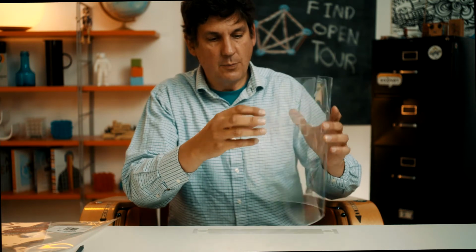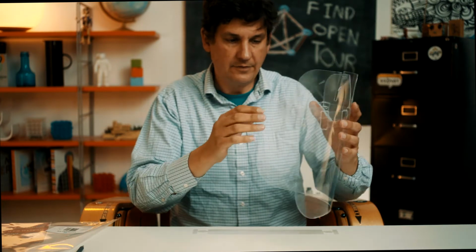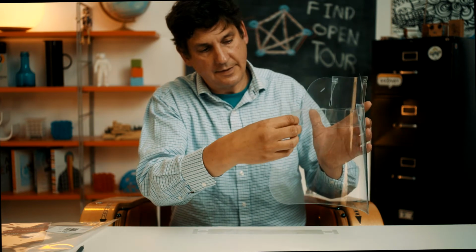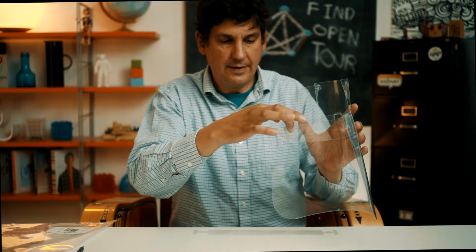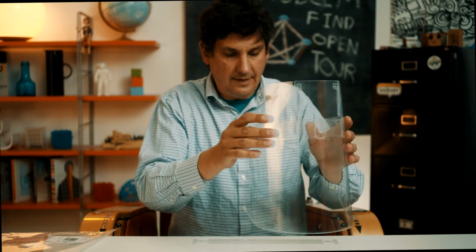If you want it so that there's more space between the face shield and your head, if you want it to be out a little bit further, then you can put it into the other slot that's closest to the edge. And if you want it tighter, you can put it in the remaining slot. So there's some kind of adjustability, but for most people, the middle slot is just fine.